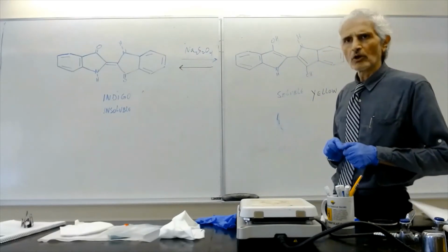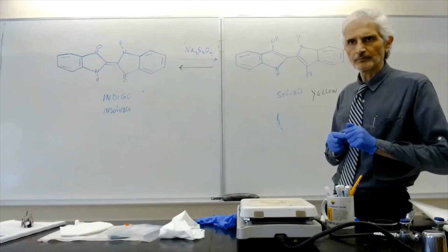Then you wash the excess off in water, right?